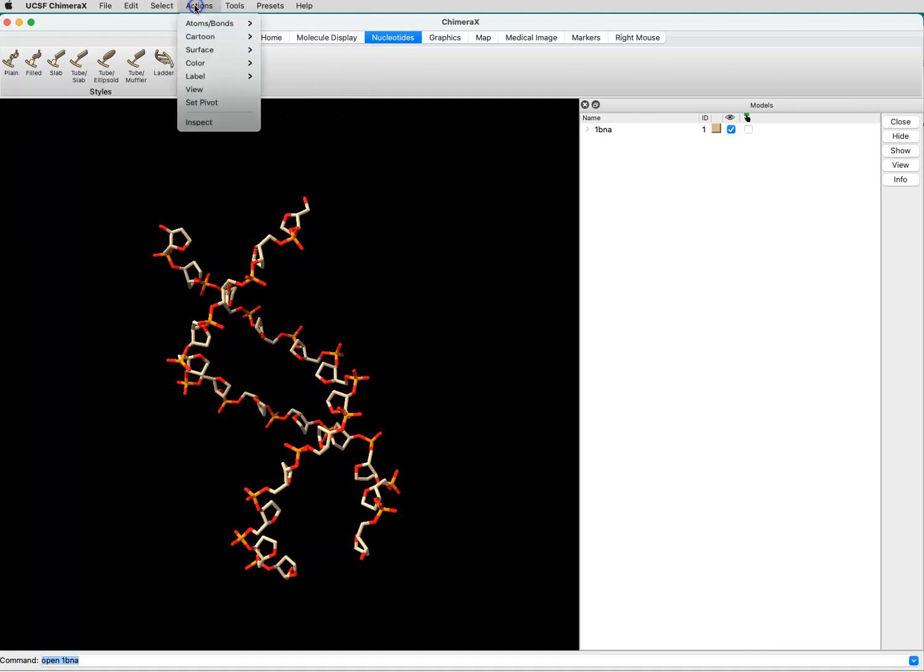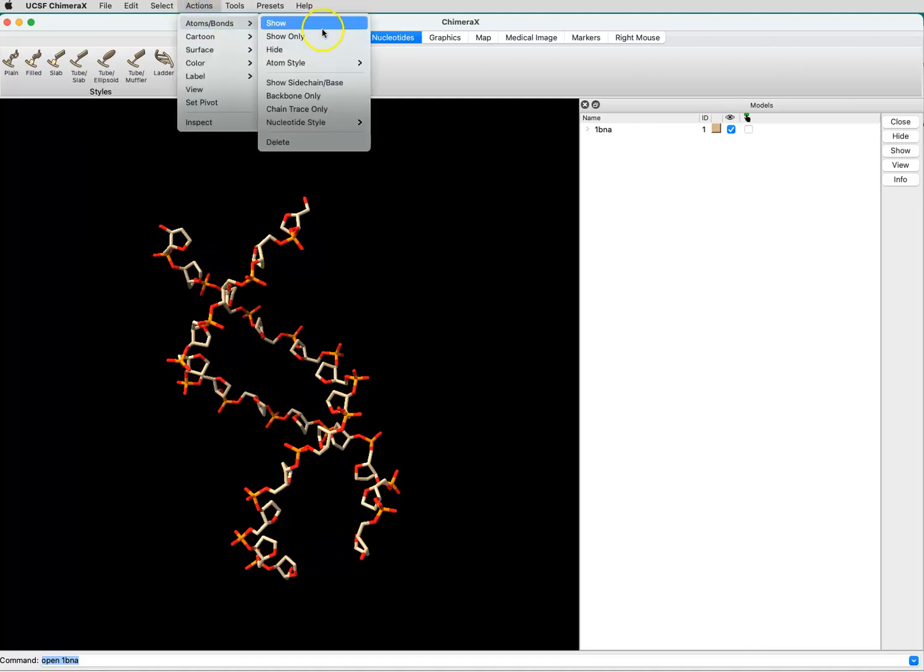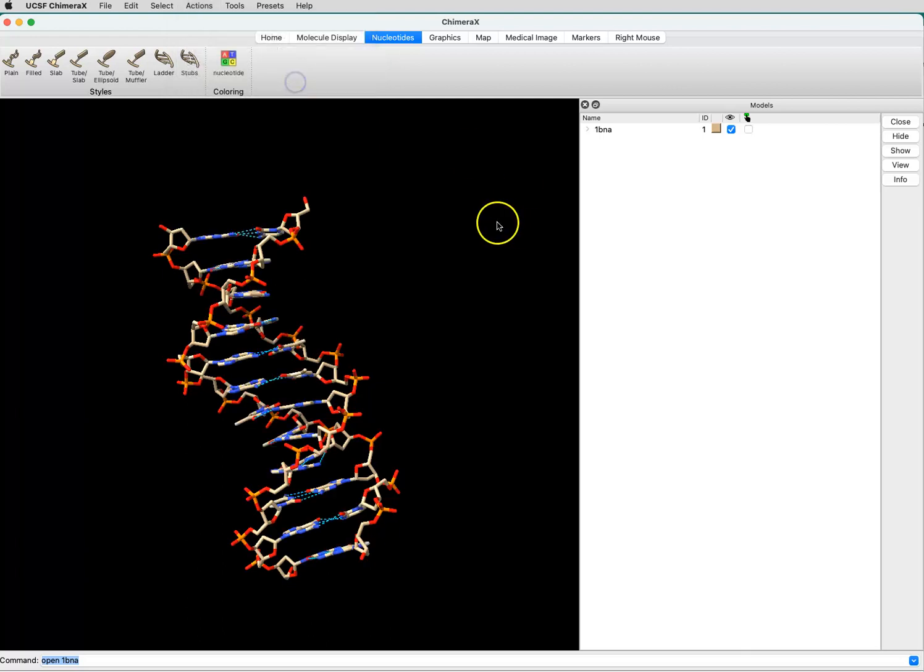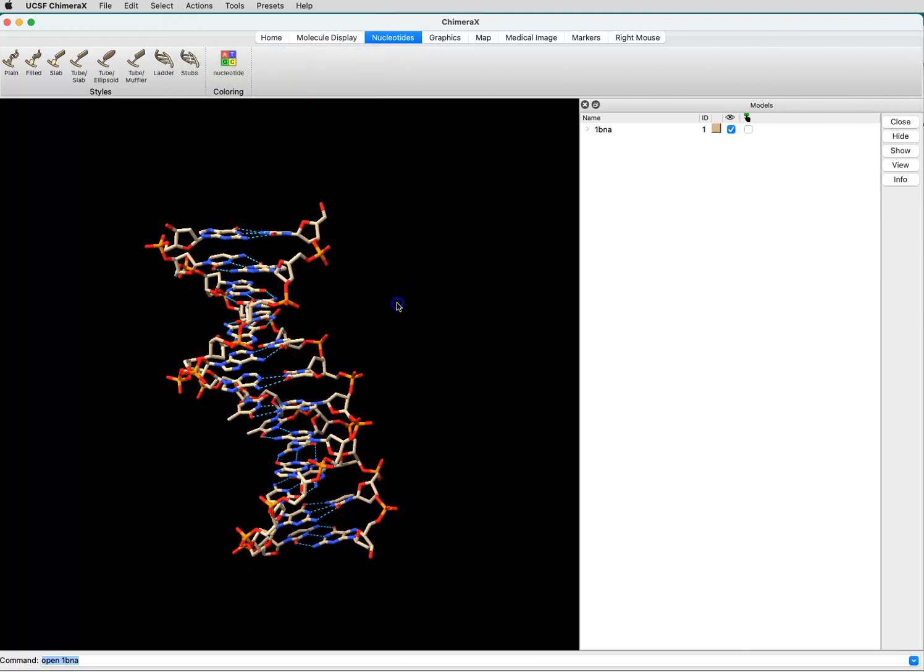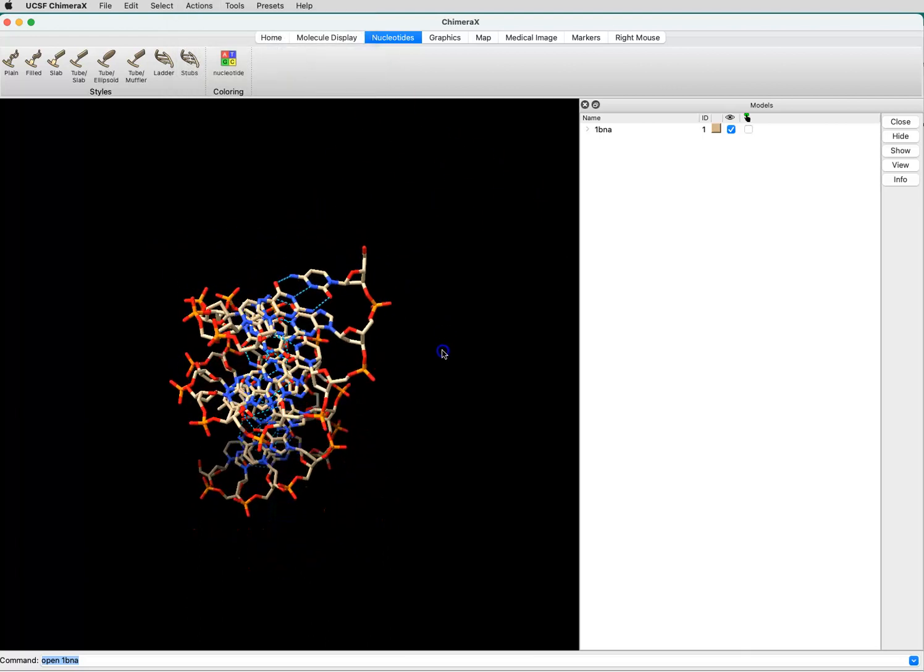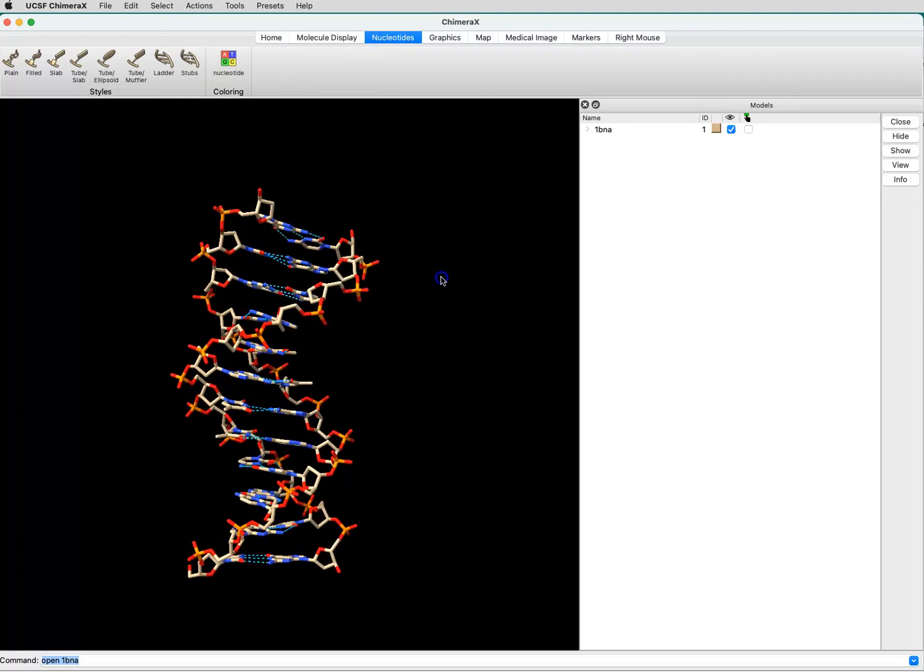Then if we go to Actions, Atoms, Bonds, Show Sidechain Base, now we see all of the atoms in our system, and we can make measurements on them.